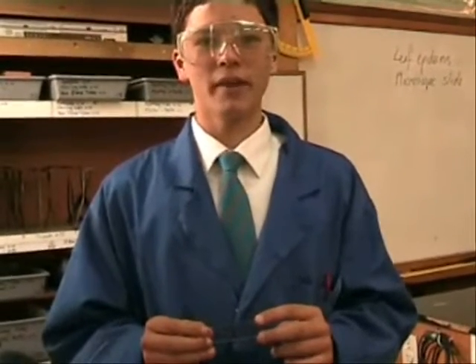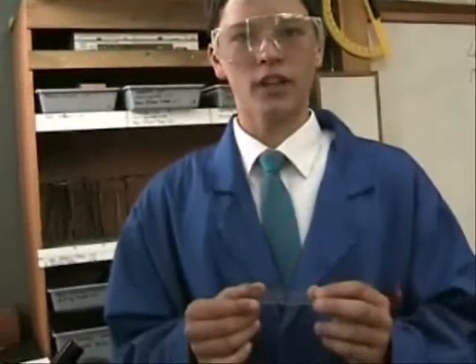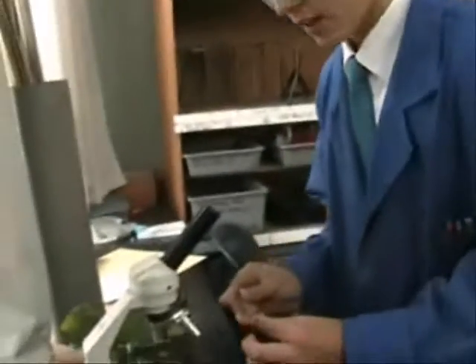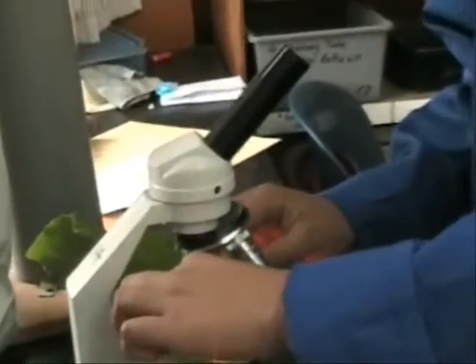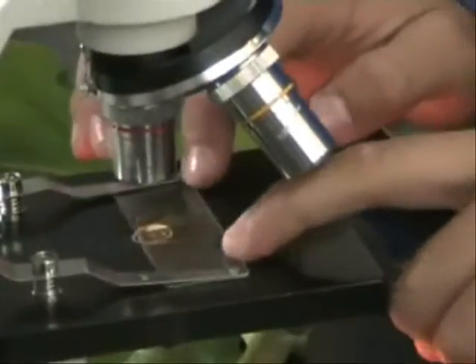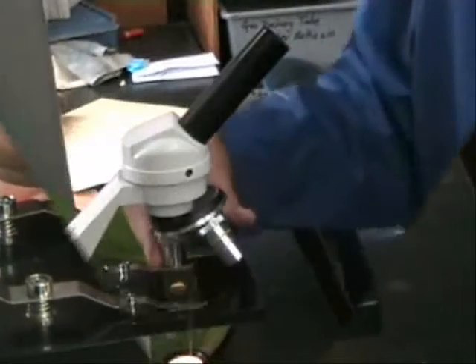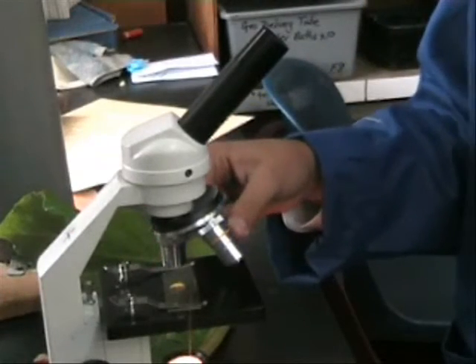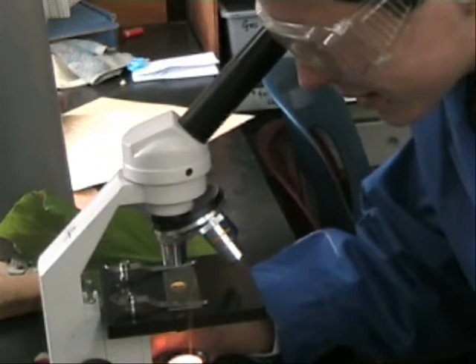Now, you are ready to experience the wonderful and magnificent glories of a rhubarb leaf. Take your slide and put it underneath the straps of the microscope. Focus it to the lowest magnification and twist the knobs.